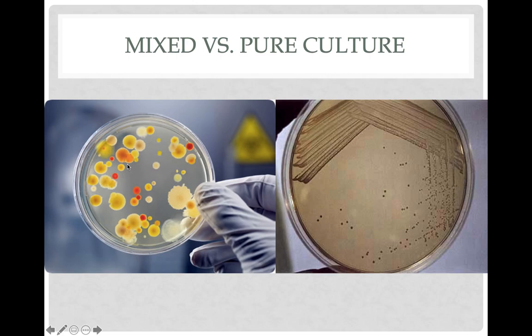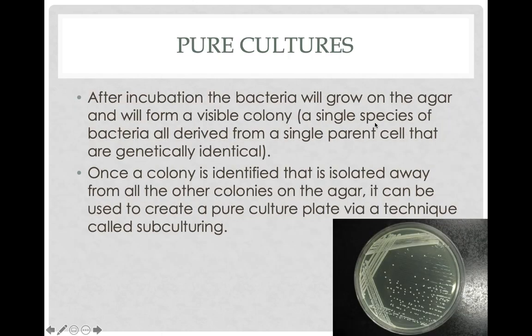Different species are going to give you different test results. This is not useful for your patient. You might kill them trying to diagnose them over here, whereas over here you have one species. Fairly easy to get reliable test results on that one. This is the whole point of a microbiology lab, is to get that pure culture.